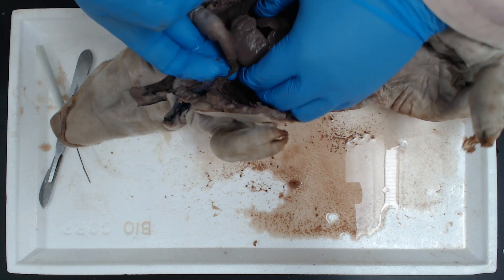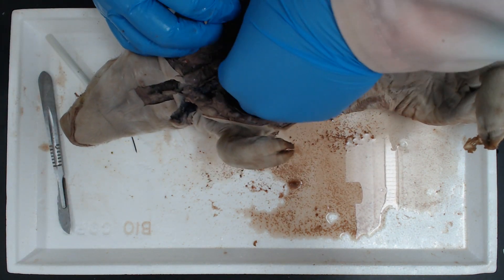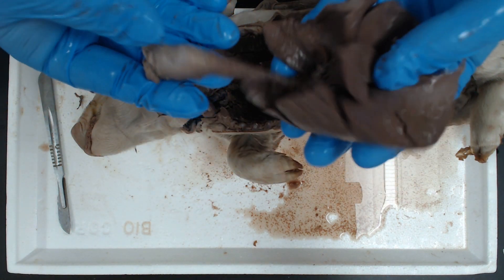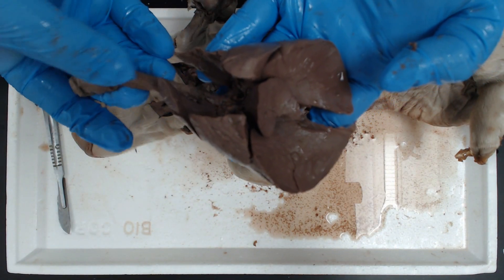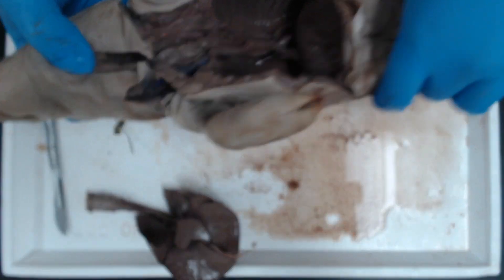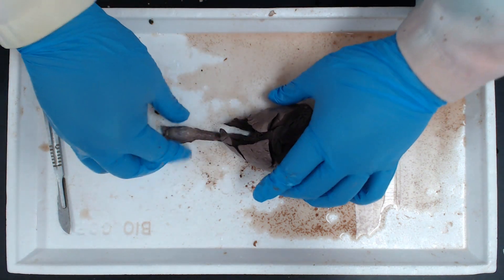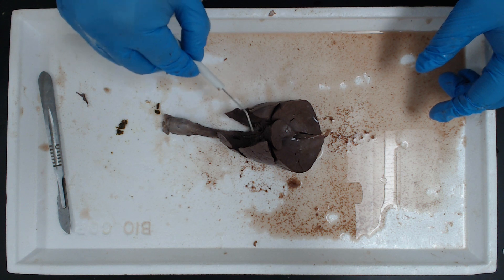Now we should just be able to lift those lungs out. We have the lungs, the larynx, the trachea. Let's put that off to the side, take care of our pig. And now we have our respiratory system. This is where our heart was, but it was removed.